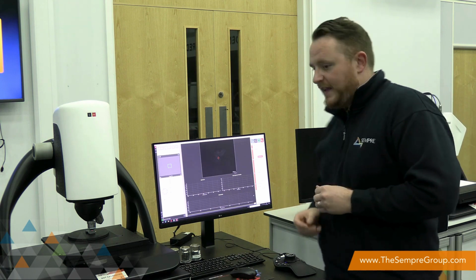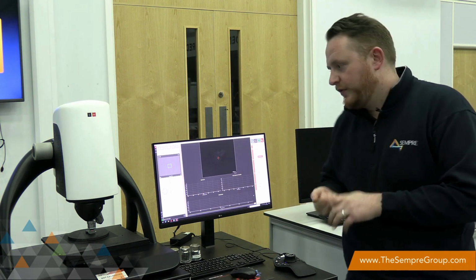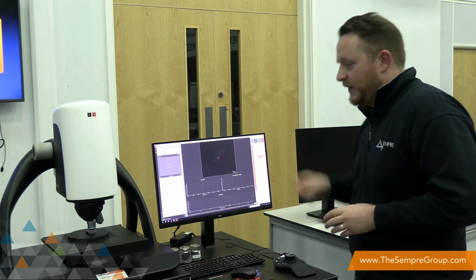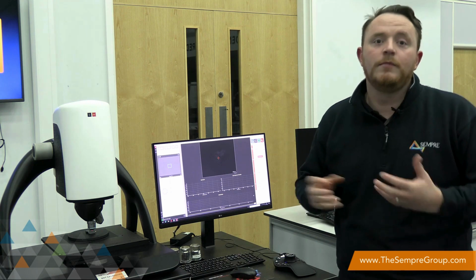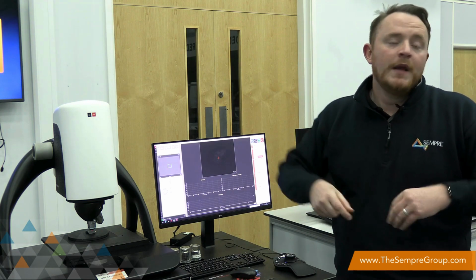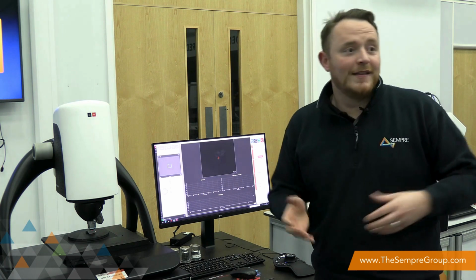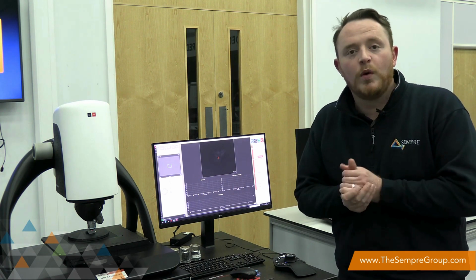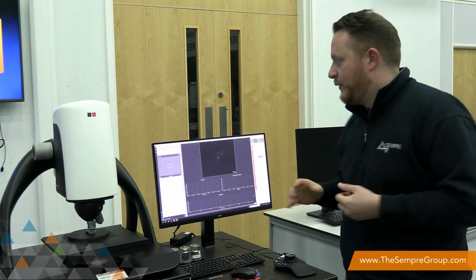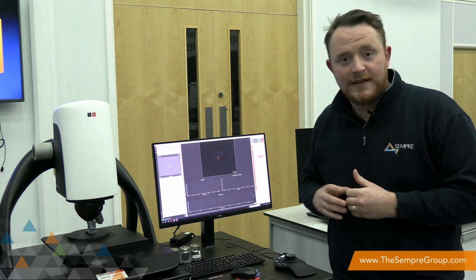From there we would take a single point, and we can range the spot size from 3.5 microns to 40 microns, taking a specific position and effectively calculating that thin film thickness. The thin film measurement, as I'd prefer to call this because the other way is a mouthful, we can measure between 50 nanometers and 1.5 microns, and the acquisition for that is less than 5 seconds. So it's a nice quick measurement once you're all set up and running.